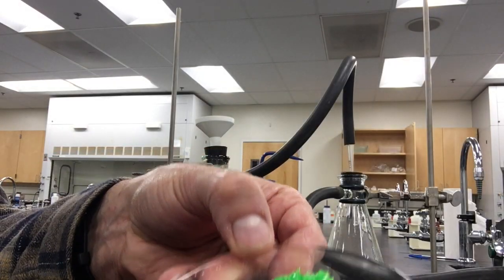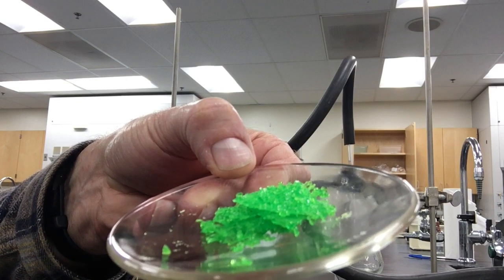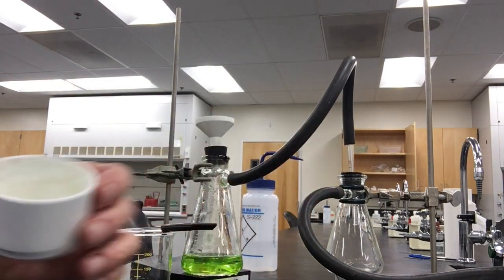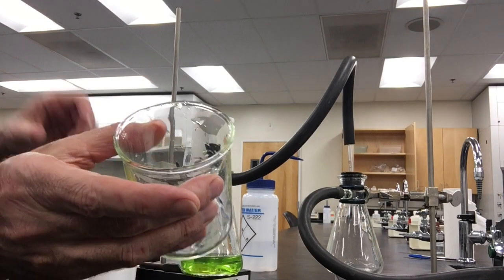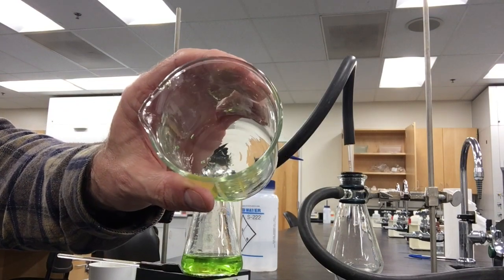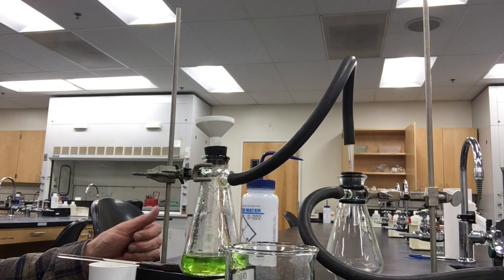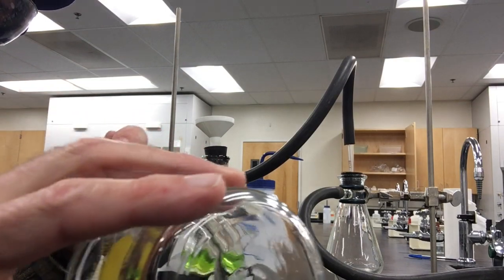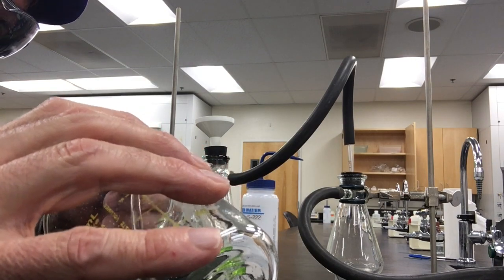I won't bore you with this process. Here are the beautiful green crystals of the coordination compound. Look in my funnel, make careful observations, and then look in my beaker. And then look in this flask. I'm showing you those observations so that you can think about some unintended unavoidable error and maybe some avoidable error. What do you think that would be?